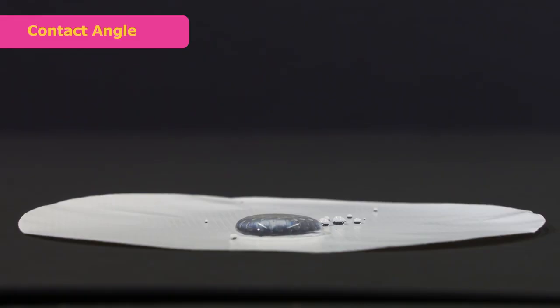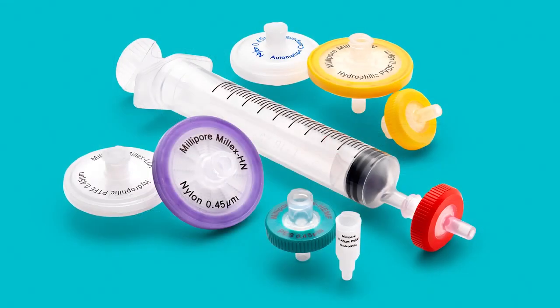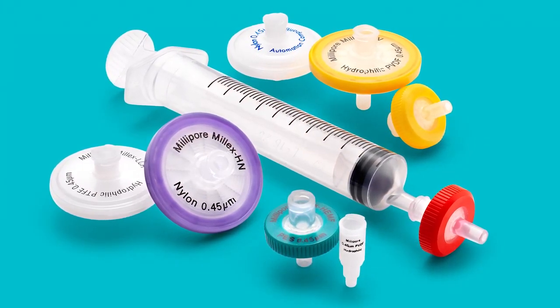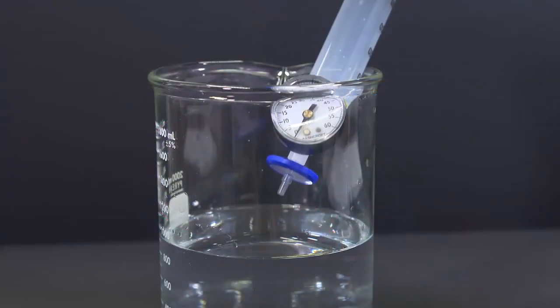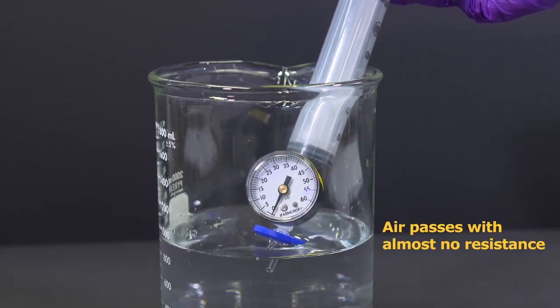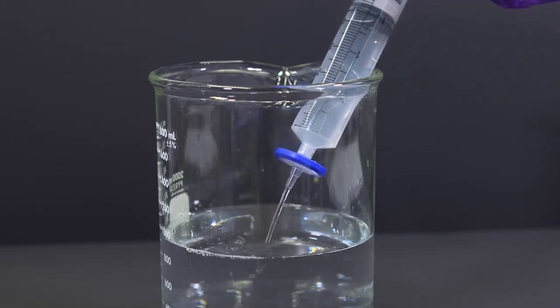The third key variable is the size of the capillary. In this graphic, the gray represents the polymeric walls of the pore and the blue represents the wetting liquid. The intermolecular attractive forces are holding the water in the pore, and the smaller the diameter of the pore, the more concentrated and stronger the capillary forces. I can demonstrate capillary forces in membranes using these syringe filters, which have membranes with different pore sizes. To start, the membranes are dry, and if I try to put air through them, the air passes with almost no resistance. Next, I completely fill the pores by forcing water through the filter.